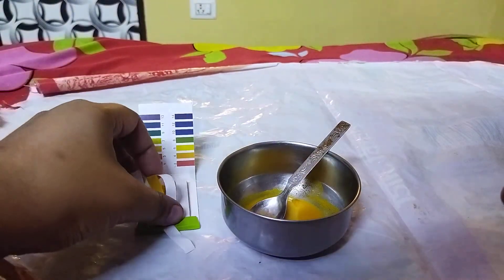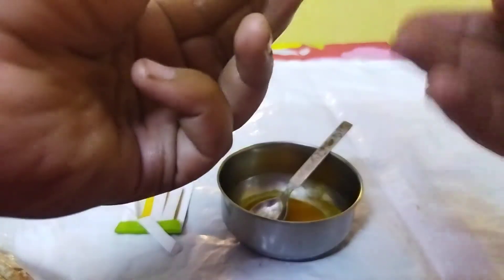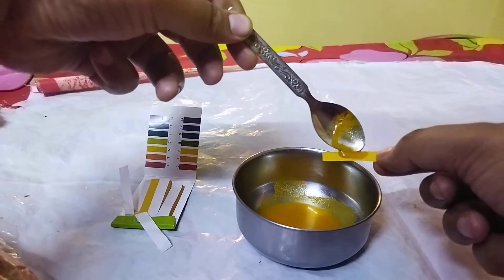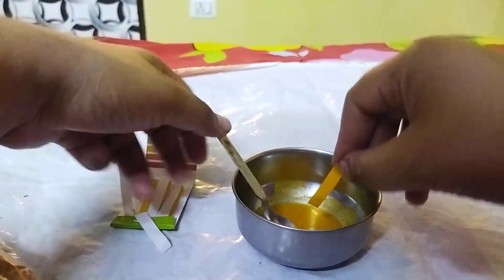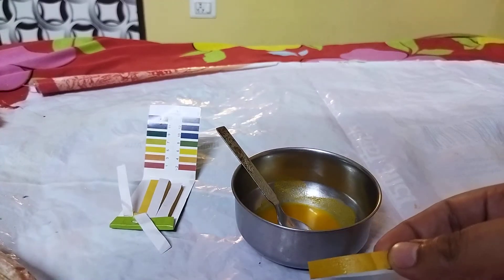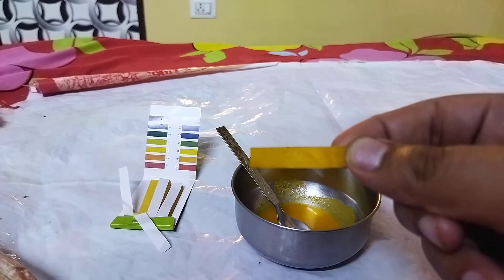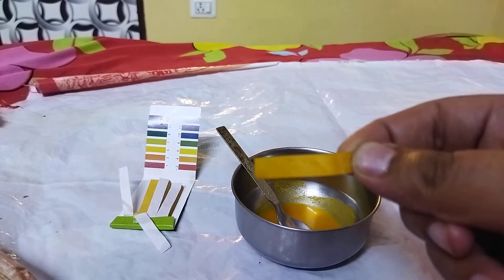Let me pull out a pH paper. Here is the pH paper, and I'm going to dip it in. We'll wait for some time to let it dry out completely for a better result.